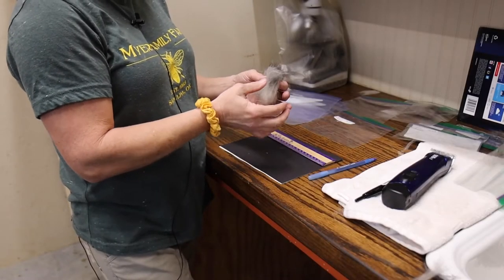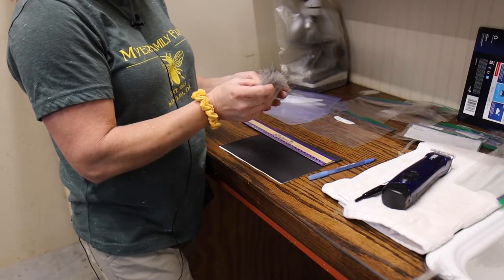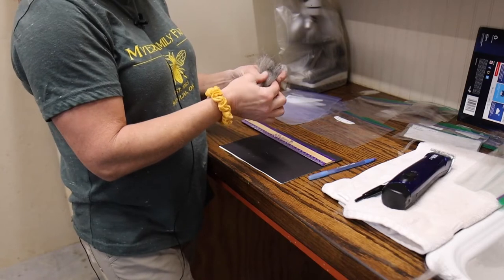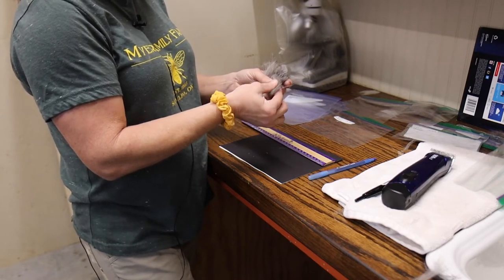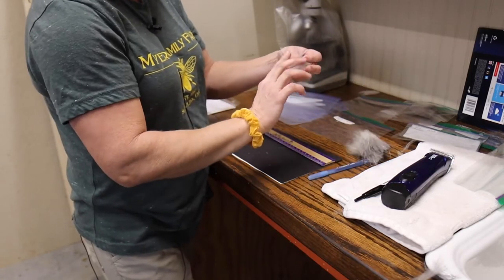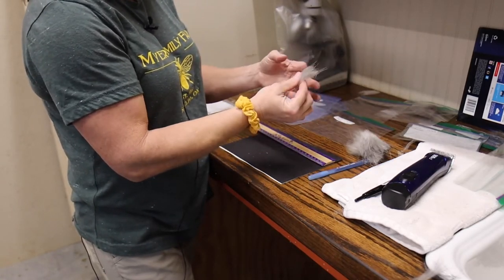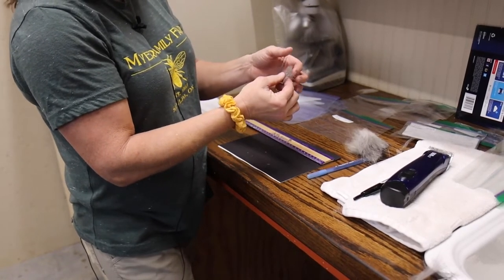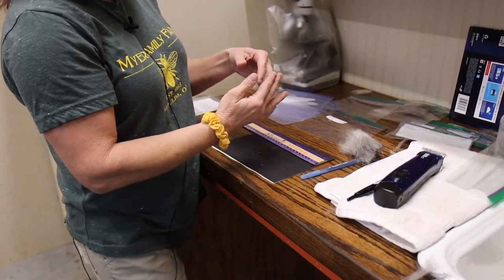I have my sample that I've sheared off the goat and it's still in its original architecture. I'm going to take off a piece that's about finger width or thumb width — it's still in its original architecture. You can see the cashmere is kind of shrunken up from the cut end.